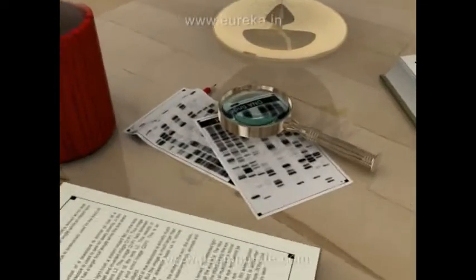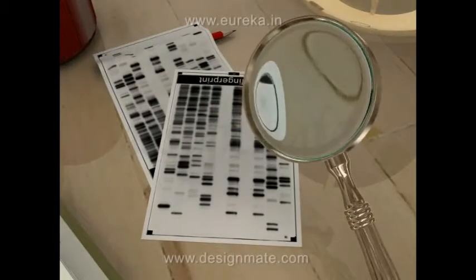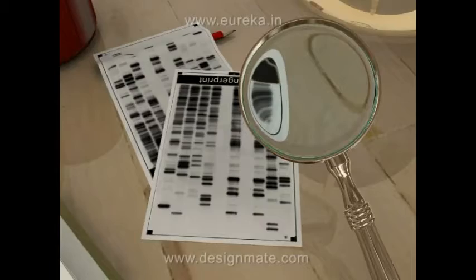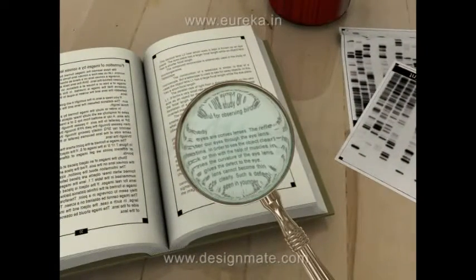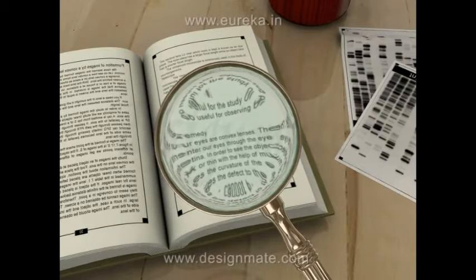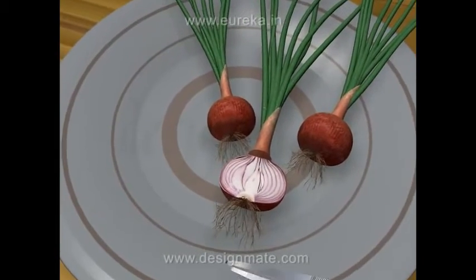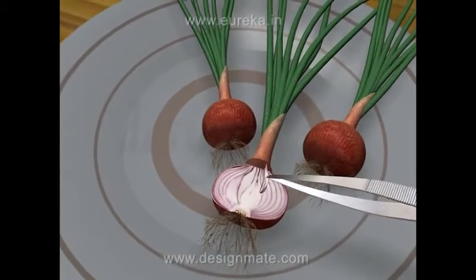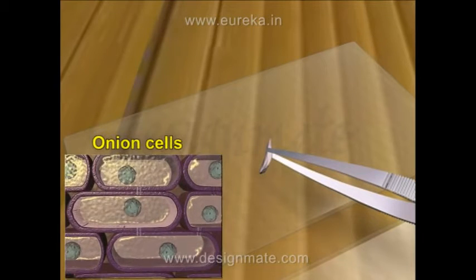We have already studied that a magnifying lens is a simple microscope which is used to magnify small objects into big ones. Just imagine how exciting it would be if we get a device with which we can clearly see the minute objects like cells, which cannot be seen with our naked eyes.